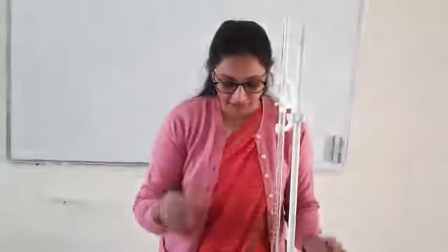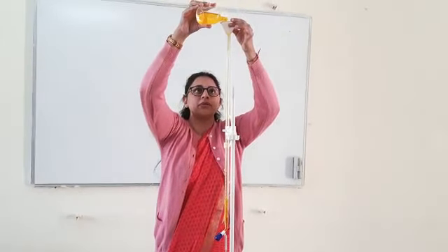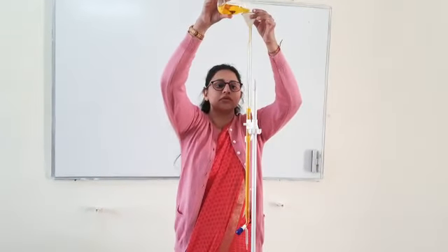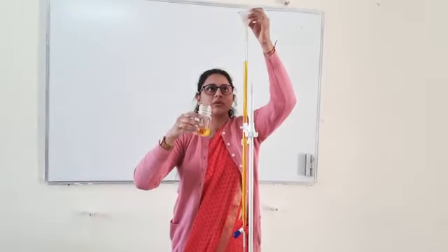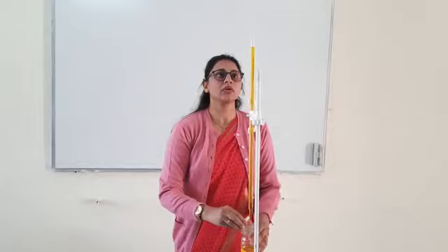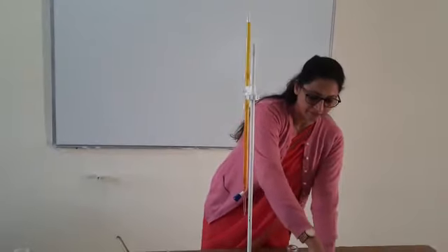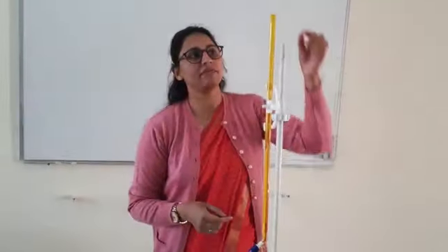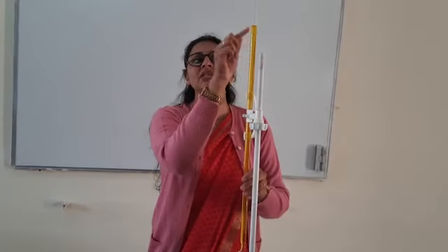We are going to fill this burette with the potassium dichromate solution. I will close this knob, place the funnel, and fill the burette. Since the reading exceeded 0 ml, I poured out some solution to get exactly 0 ml. This burette has a capacity of 50 ml. Since the solution is colored, I will read the upper meniscus, which should match with the 0 ml line of the burette. This is how we have filled the burette with the potassium dichromate solution.